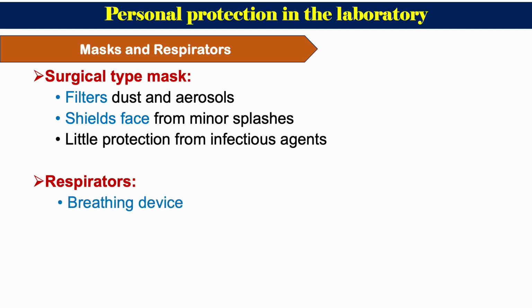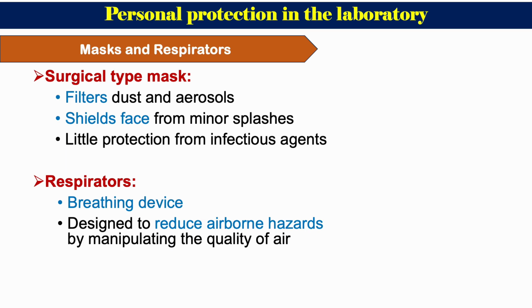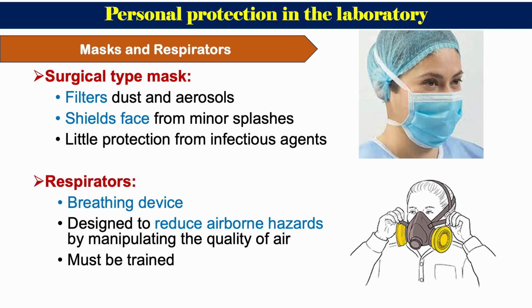Followed by the respirator. It is a type of breathing device designed to reduce airborne hazards by manipulating the quality of air. So while using a respirator, laboratory personnel must be well trained. Otherwise, there may be breathing problems.